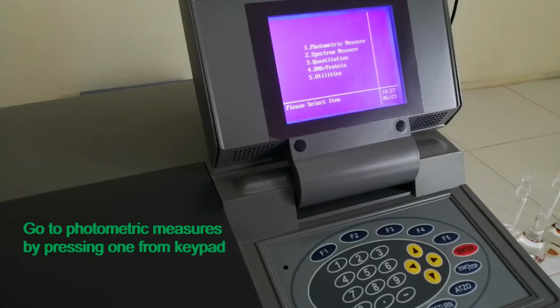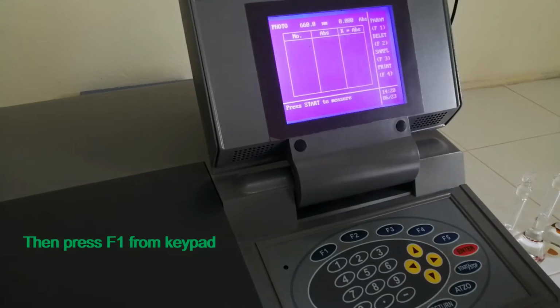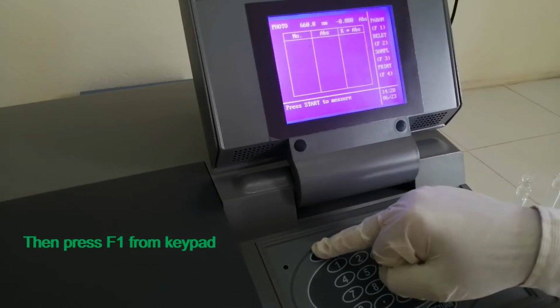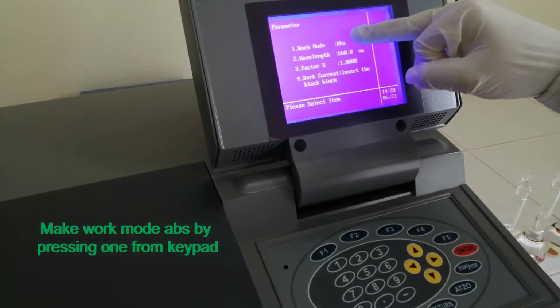Go to photometric measures by pressing 1 from the keypad. Then press F1 from the keypad. Make work mode ABS by pressing 1 from the keypad.